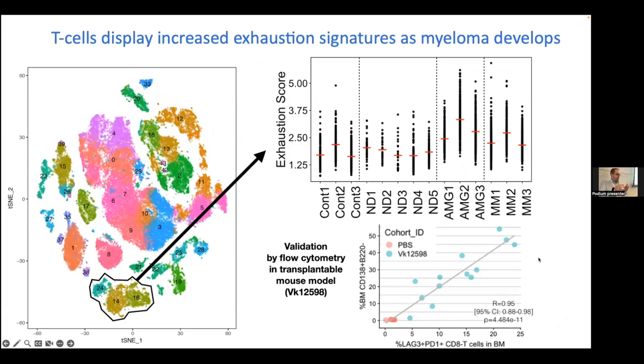So that was our lesson looking at the cancer cells. We saw this trajectory, this movement of the B cells. Now we're interested in the T cells. We want to understand why these myeloma cells get a foothold and why they persist. Why isn't the mouse's immune system clearing these cancers out? So we pulled out specifically the T cell population, and one of the roles of T cells is cancer surveillance. They're supposed to be going around killing all these malignant cells.